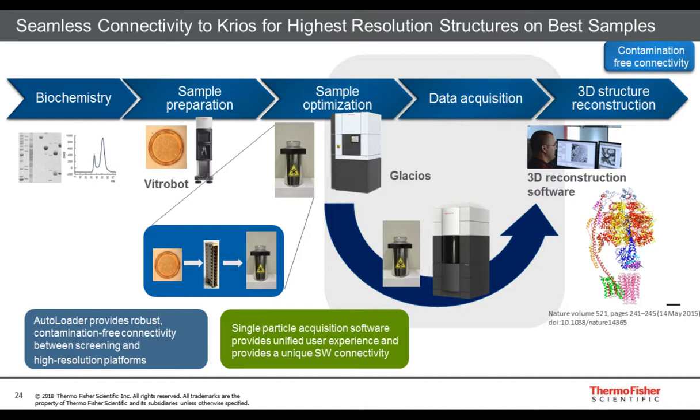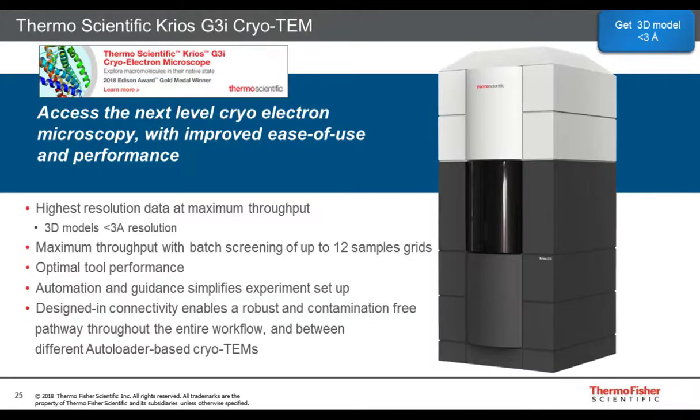Well, if you now, after hearing this story, have become interested in Cryo-EM as a technology, and you wonder how can I engage, how can I adopt this new type of experiment, a new type of application, then there are various ways to do it. You can team up with an academic partner that happens to do Cryo-EM already for some time. You can go to a centralized service facility. There are more and more synchrotrons currently that have adopted and purchased microscopes in order to obtain data that can be used for reconstruction of data.